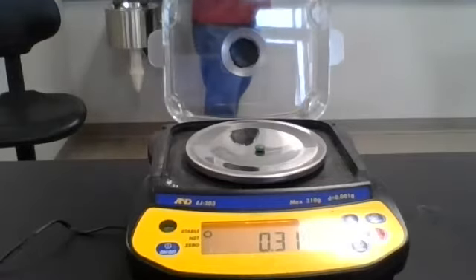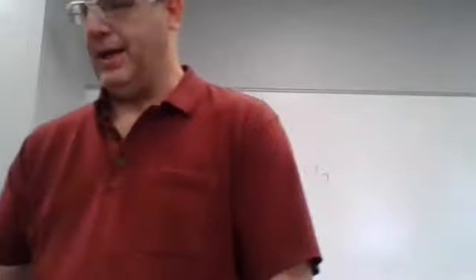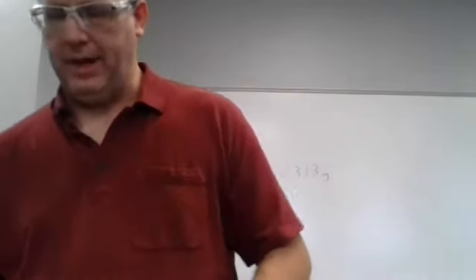That is the mass of the iron tablet. Okay. And in that, we should have about 65 milligrams of iron. Now, in order to evaluate the iron tablet, I'm going to have to dissolve that. But in order to dissolve it, I need to crush it. So I am going to put it in our handy dandy mortar and pestle, and I'm going to crush it.